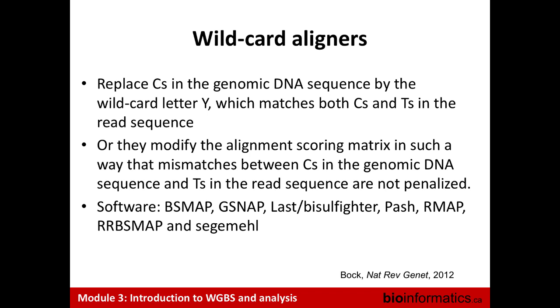So my question is, if you have a lot of wildcards in a given read, it becomes very expensive. That's right, and we'll get to that. The tricky part, as we'll see, is that what happens in the end is also sensitive to the density of Cs and CpGs, at some level. So this is going to work well if all you have is one of these Cs in the middle of a very information-rich sequence. But again, wildcard aligners allow Cs to match with anything.